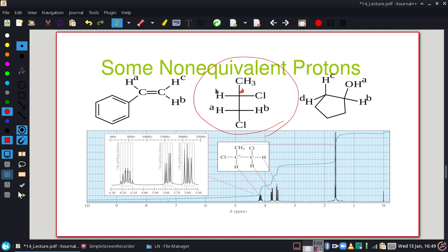And that really does mean, if we're looking at that hydrogen right there, while it is split by these 2 hydrogens and those 3, this one here is actually split by this one and this one. Because even though they're equivalent, they're not exactly the same, so we get a weird splitting pattern. That's what they're showing here. We get this very nice, pretty septuplet because this hydrogen is split by those 3 and those 2. But these 2 are this guy and this guy individually.